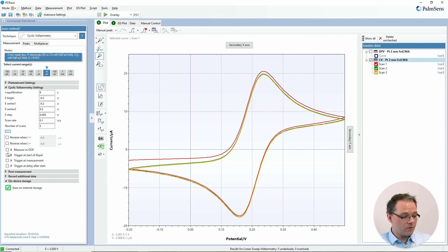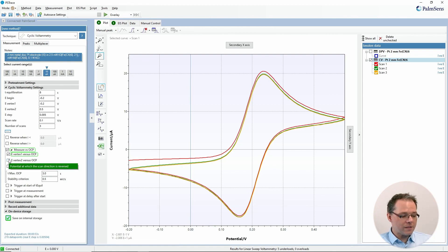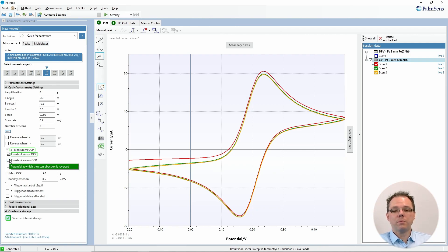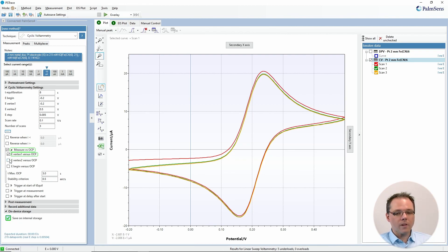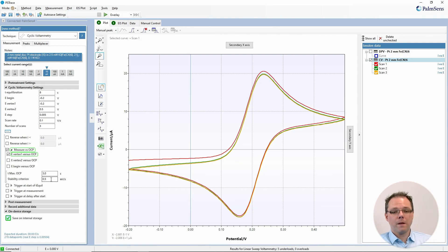There is also the option to use the OCP as a reference instead of the reference electrode — so instead of all potentials being versus the reference electrode, right before the measurement a small OCP measurement is performed, and that value is used as the zero for the potentiostat. You can set which potentials will be used against the OCP, how long the OCP should be measured before the experiment starts, and which stability criteria need to be met.